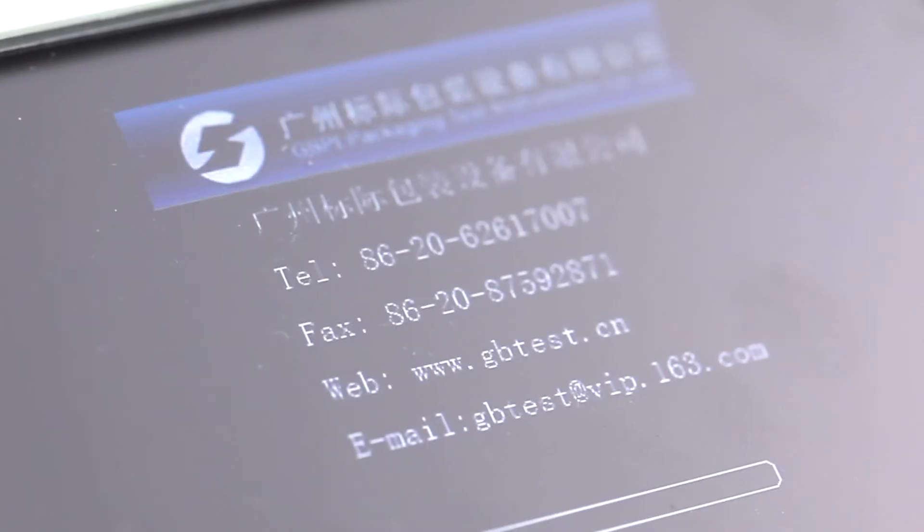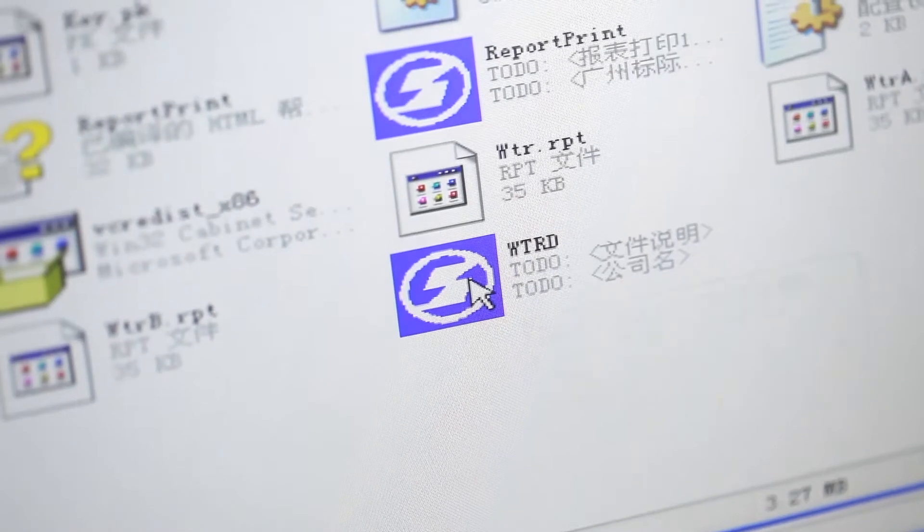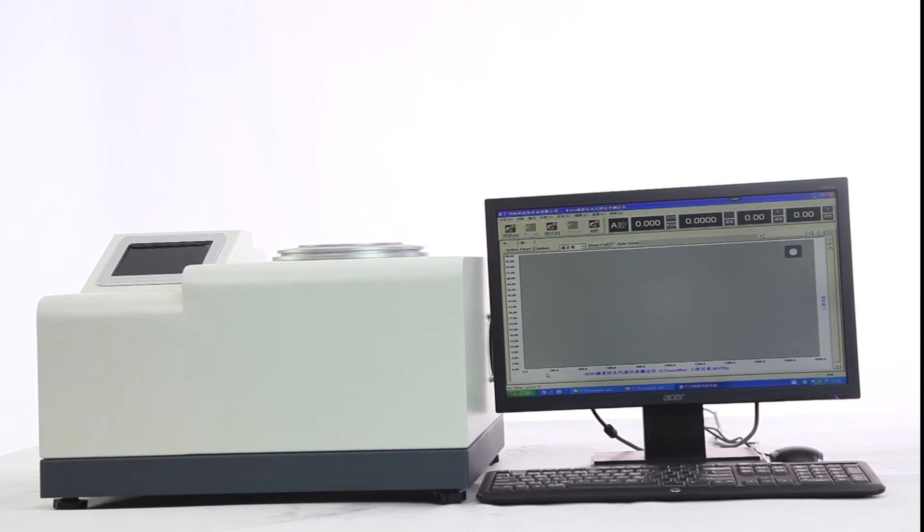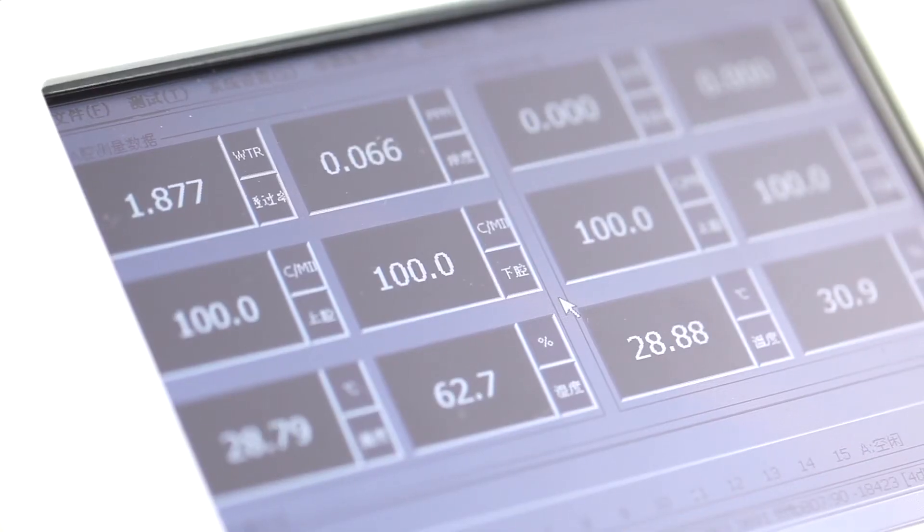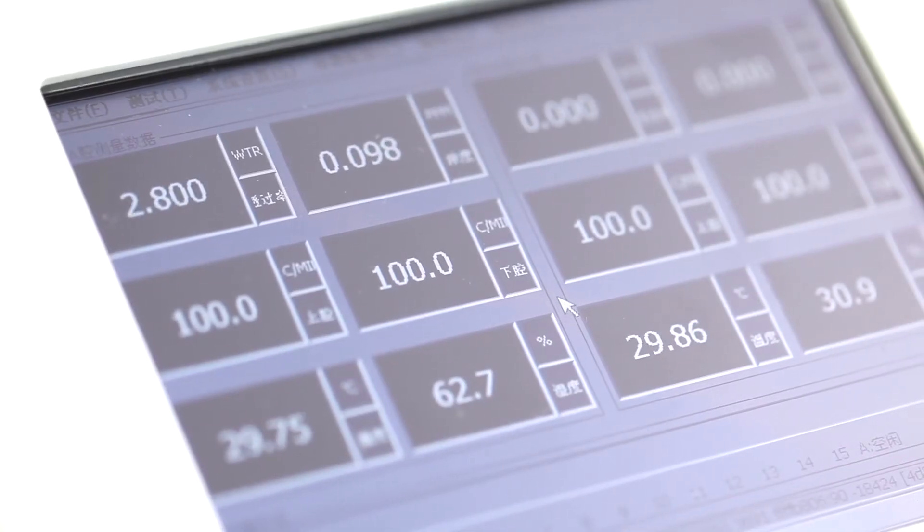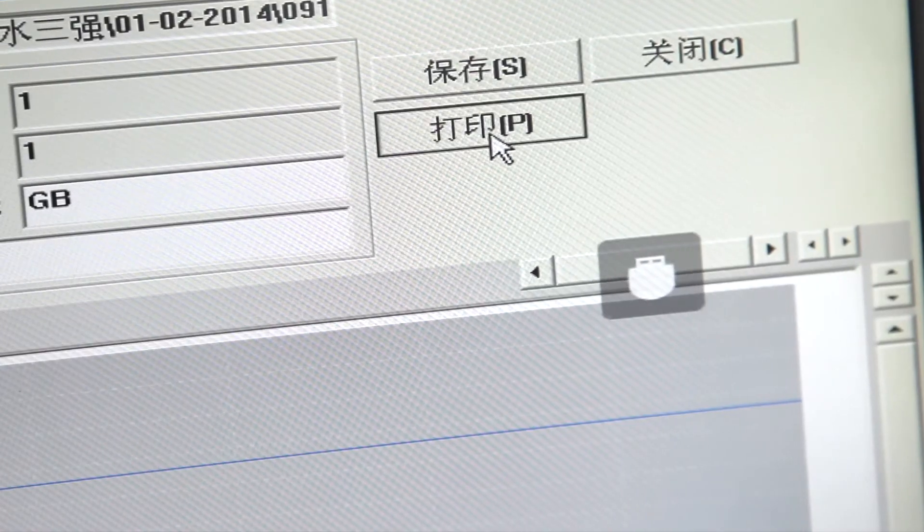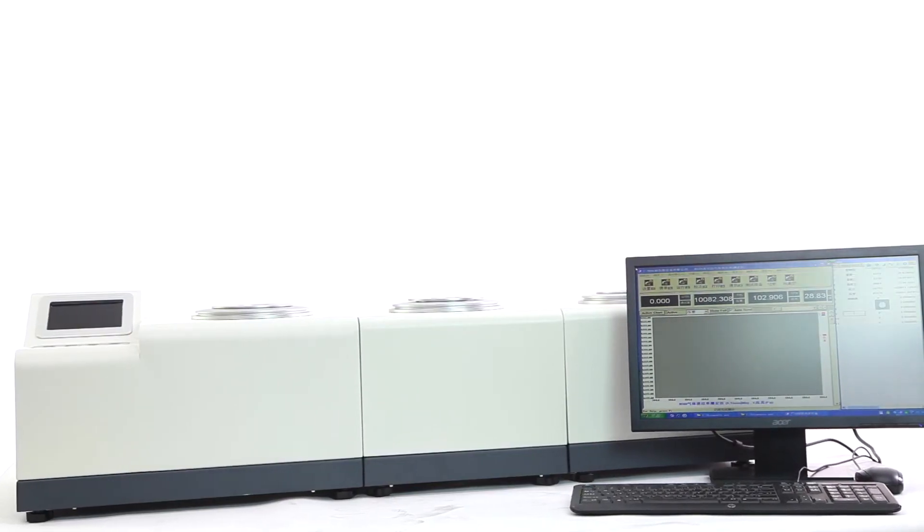It is true color LCD display with built-in operation system. Can work independently without computer. Can real-time display curves, process data and print report. It's easy to operate.